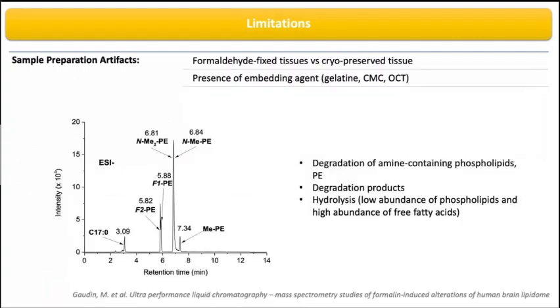And lastly, it's the sample preparation artifact. When we prepare a tissue, it's important to know if we are going to fix the tissue or not.